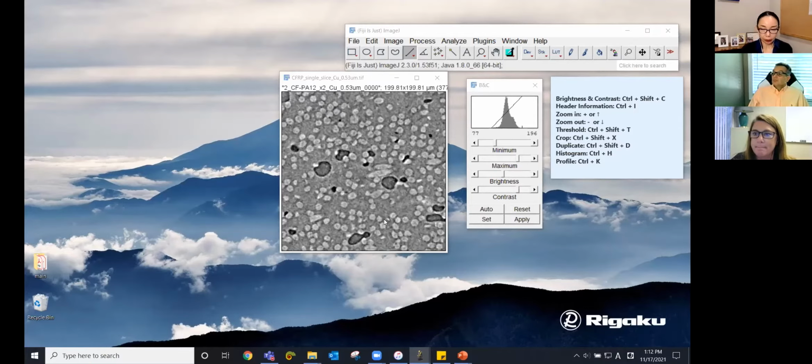Okay, well, that is the correct answer. The first 2 will get you closer to segmenting the image, but not quite. So let's try the Weka machine learning segmentation. This is a single scan, but I'm going to use this scan to train the machine learning program, and we're going to apply it to the 3D CT scan afterwards.